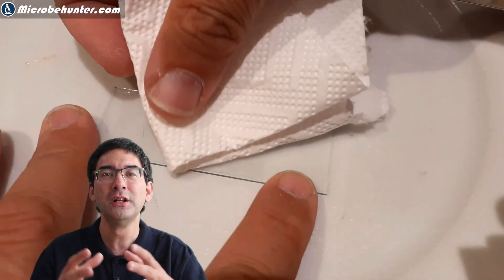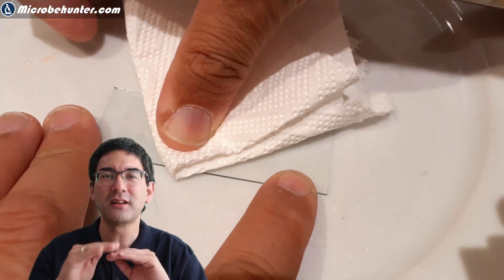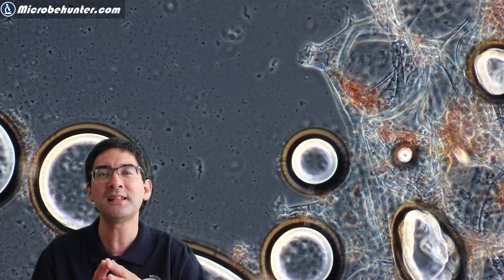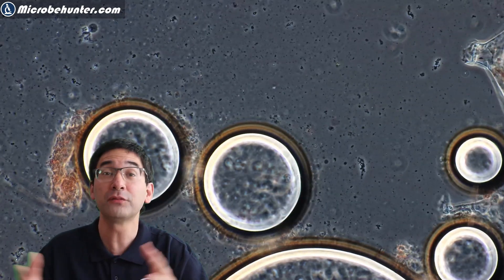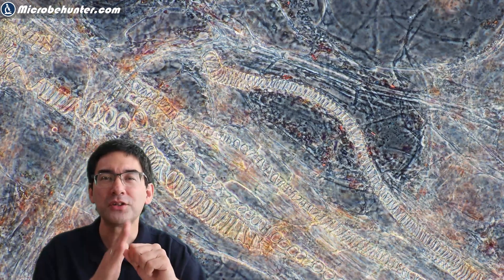I cut open the watermelon to take a sample from the inside, which was significantly harder — showing that bacteria hadn't reached the inside yet. I had to press down the cover glass on the slide to make it flat. I still saw those small dots but significantly fewer, and I think many were simply fragments of cells from preparing the slide. Those that were there probably came from my contaminated knife.